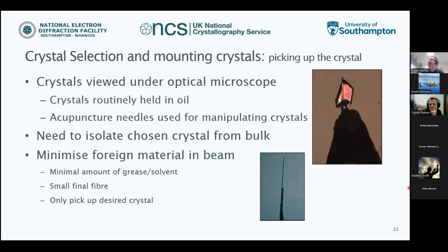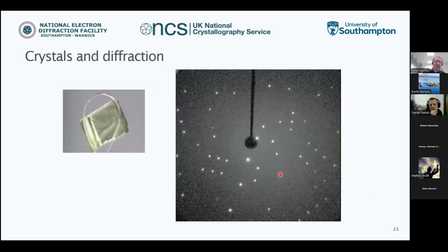So this one, crystal mounted fine. You can see all this lump of solid underneath. That will cause problems with the X-ray beam. We'll get a lot of diffuse diffraction off that, which can change our images. So this one actually, although it's a very thin needle mounted, was probably a good one because we can fire the X-rays up here and actually have almost purely the crystal in the beam and nothing else. So yeah, we want one crystal on its own. One of the things you can have is loops.